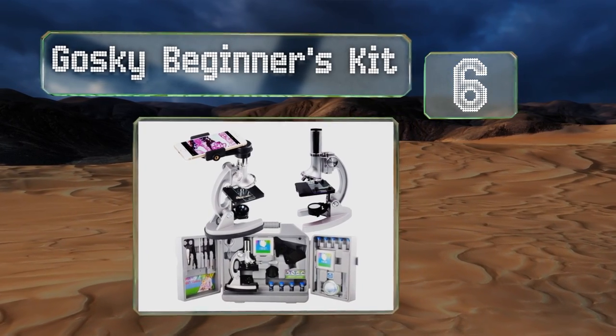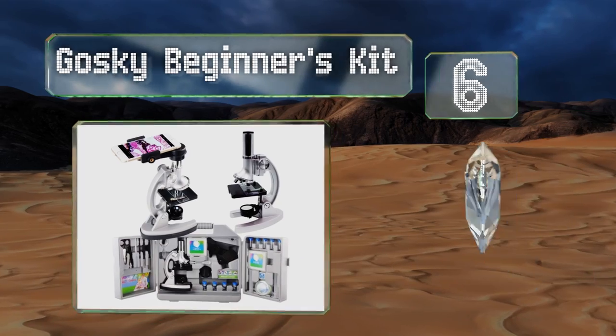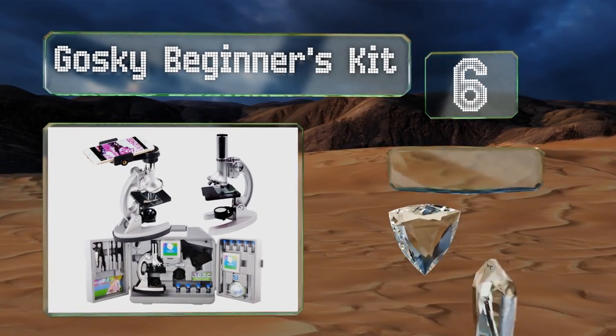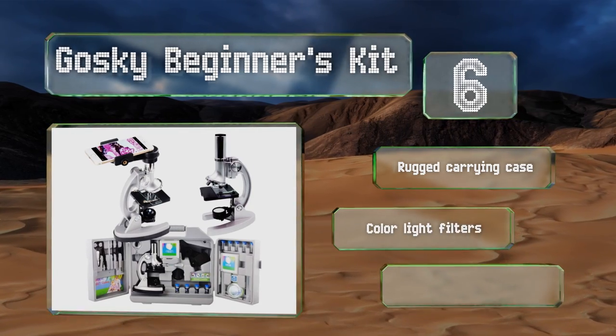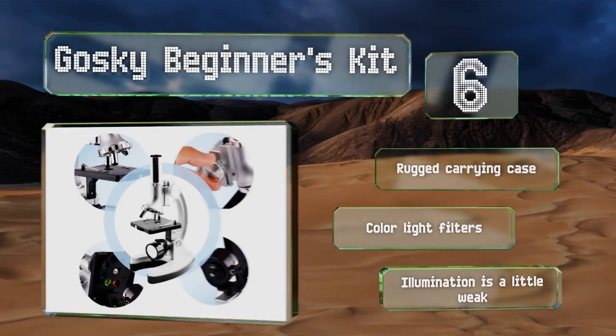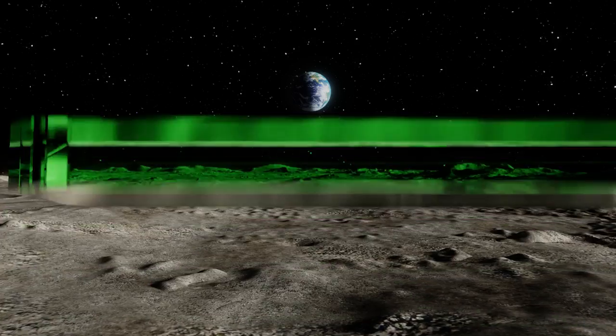Moving up our list to number six, the most exciting thing about the Goski Beginners Kit is that it comes with an eyepiece designed to fit the camera on most smartphones. That way you can focus in on a view of your slide and snap photos or videos of it for a school presentation. It includes a rugged carrying case and color light filters; however, its illumination is a little weak.